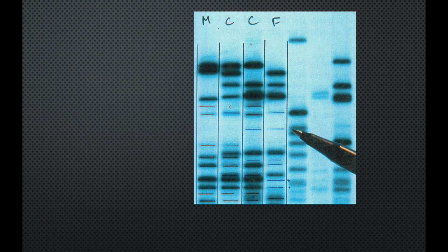That's ultimately what PCR and gel electrophoresis give you: a fingerprint of an individual whose own DNA segments and bands are completely their own. Again, with the exception of identical twins, everyone on the planet is going to have a different barcode of DNA segments that make up the DNA inside of their own personal genome.